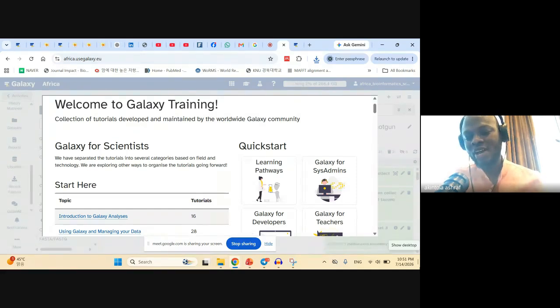Galaxy has a wide array of different trainings for different purposes and different uses. It depends on what you want to focus on that will determine what you are going to do with Galaxy. There are also different datasets you can play around with that would make you an expert and able to use that expertise on your own data.